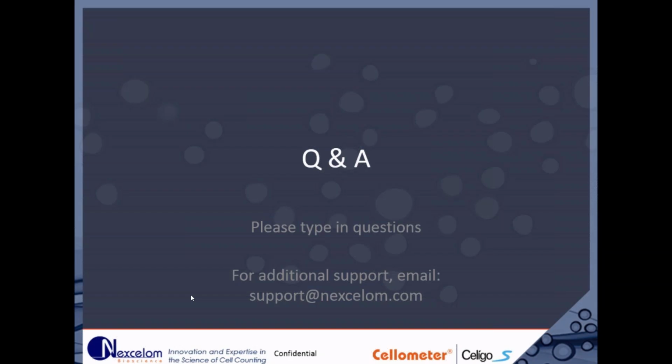Before we go on to that, let me just point out that as soon as you close that session, meaning go back to the Start tab, that saved experiment is not editable. You'd have to reload the saved experiment, and then you can recall it, and it should update with any new changes. So to make changes, you have to be in the Celigo software with that saved experiment loaded, if you've gone out and come back in. Thank you for clarifying.